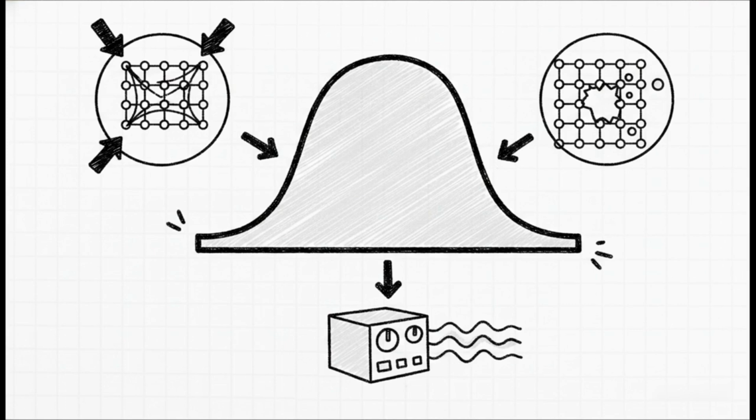If the crystal lattice is under physical strain or it's full of defects and dislocations, that peak is going to widen. Even the XRD machine itself naturally widens the peak a bit. That's why for super accurate results, scientists have to correct for the machine using a standard material. And if they really need to separate the size and strain effects, they'll use something called a Williamson-Hall analysis.